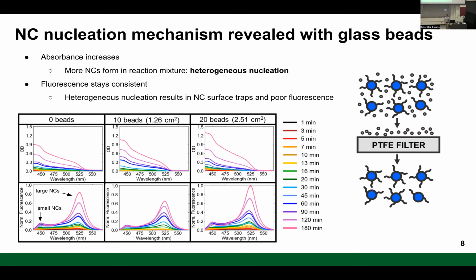How do we normalize it? That's something we just do in the code. In Python, we can find the largest fluorescence feature, and then we just normalize it to that. We only would normalize it to our largest fluorescence data out of all of the syntheses.